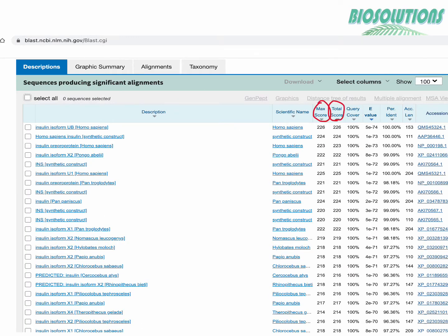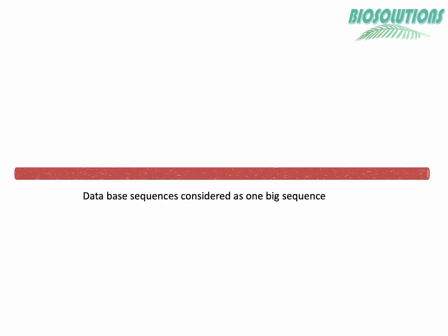Going back to description table, all the max scores are same as total scores. This means that human insulin sequence was aligned only once with other insulin sequences in the database and scores were calculated. Are you confused?